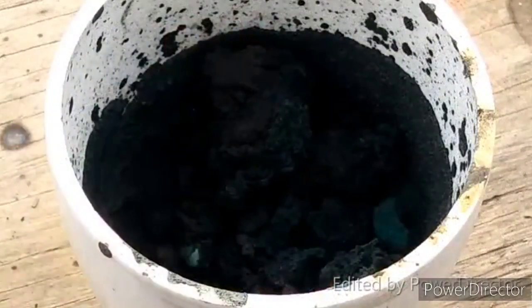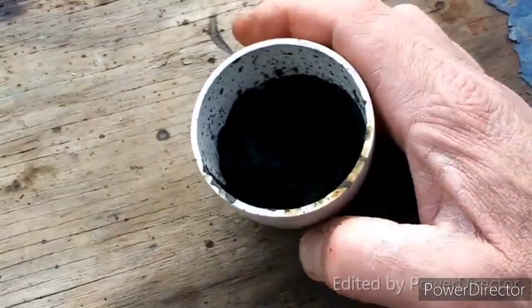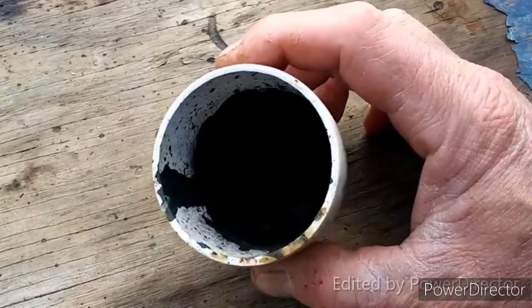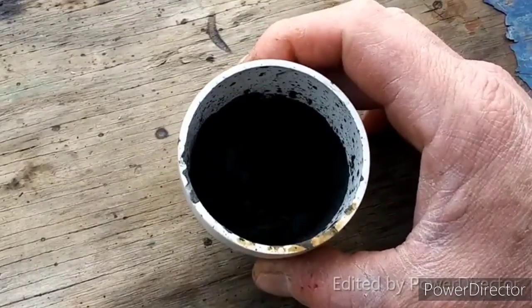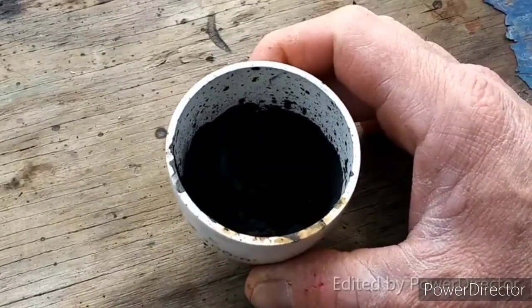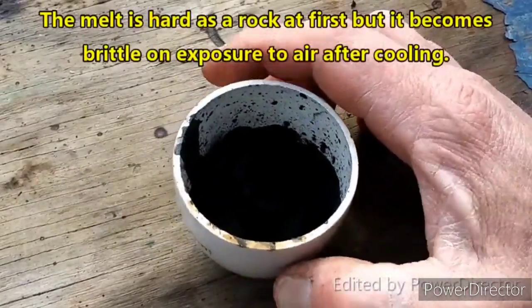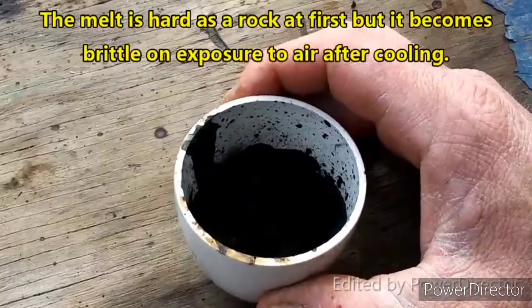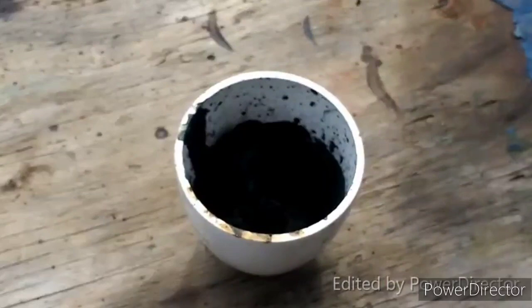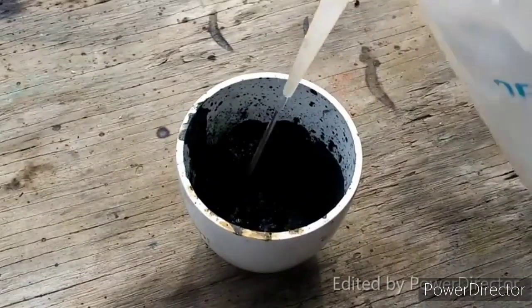Okay, this is our solidified melt. You can see it is dark green in spots and kind of black in others. I'm not really sure — it may be that a lot of the manganese dioxide didn't react, though it's very hard to tell.